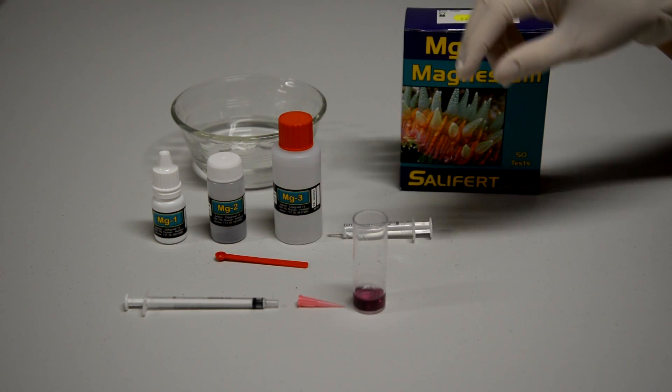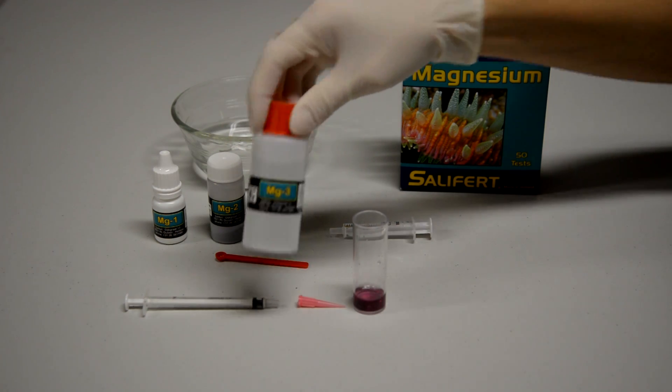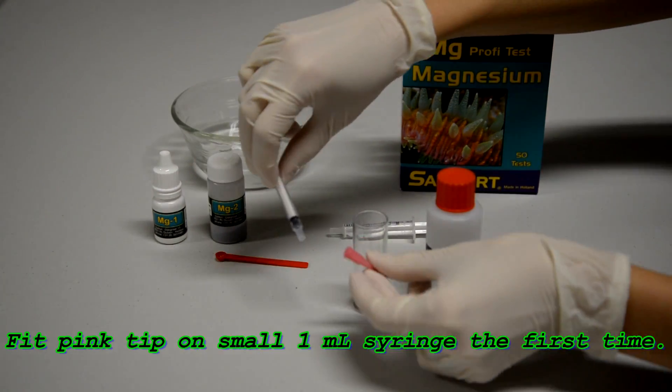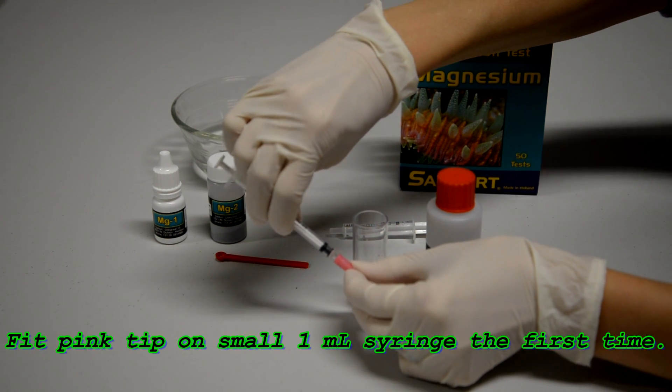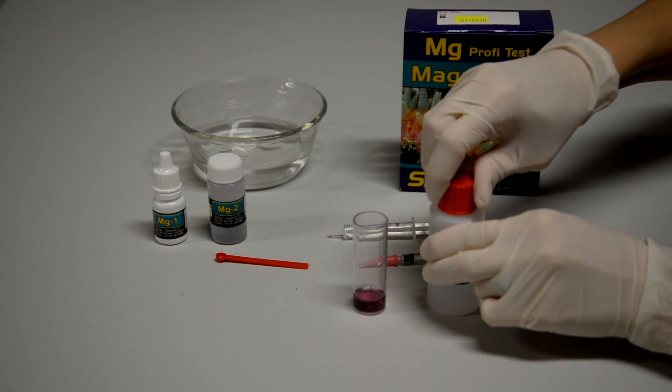So after that, we're going to put in magnesium 3. And for magnesium 3, they give us this special calibrated 1 ml syringe with a very fine pink tip that you want to put on. You only have to do that the first time.